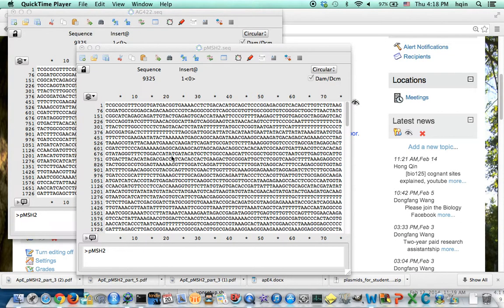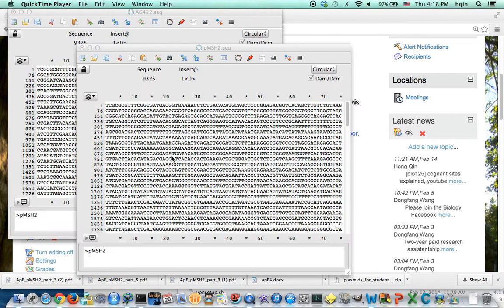Hi, in this video I will demonstrate how to find a restriction enzyme that can be used to distinguish the wild type MSH2 from the mutant MSH2.